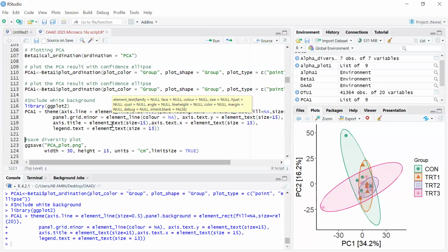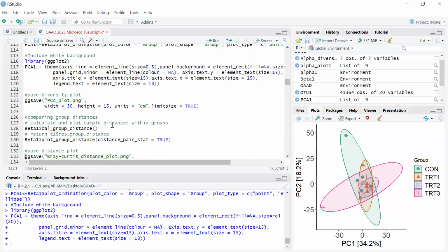Well, I use PCA actually, but I'm new to everything microbial, so that's what I'm asking. Is there a different way we interpret it? That's what I'm trying to ask. PCoA is particularly suited for microbiome data, so it shows how closely the microbes are related to each other. All right.